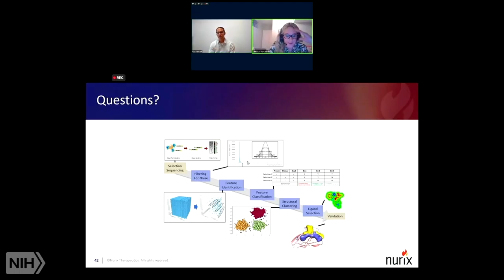Okay, there's a bunch here. Hi, Paul, can you elucidate a bit more on your approach of using a machine learning approach to identify FP and FN? Sure. I'll defer most of this to Jeff. But yeah, there's been a lot of activity recently in the combination of DEL plus machine learning. And a paper that we thought was pretty seminal was from the XChem and Google group last January. But here you're just taking your disynthon enrichment data and feeding it into one of a variety of different architectures.